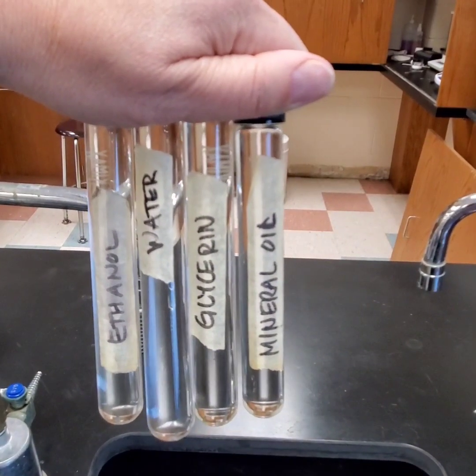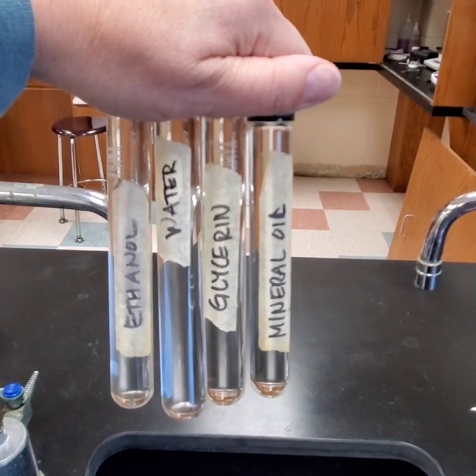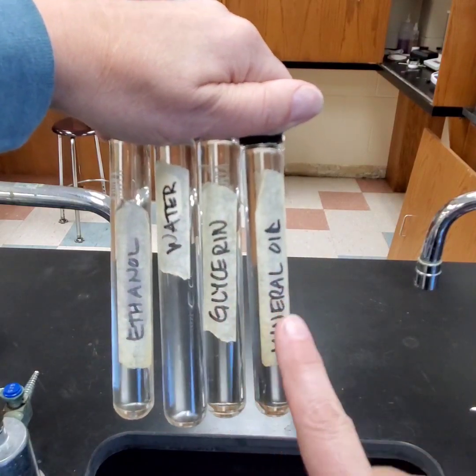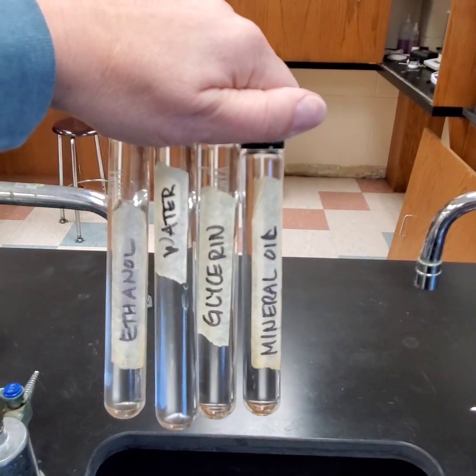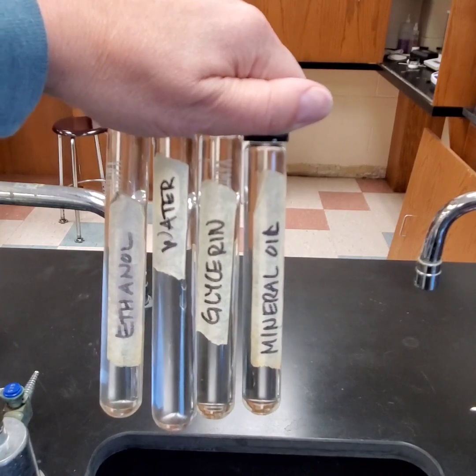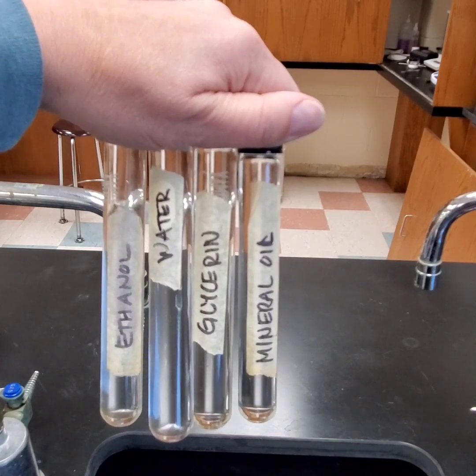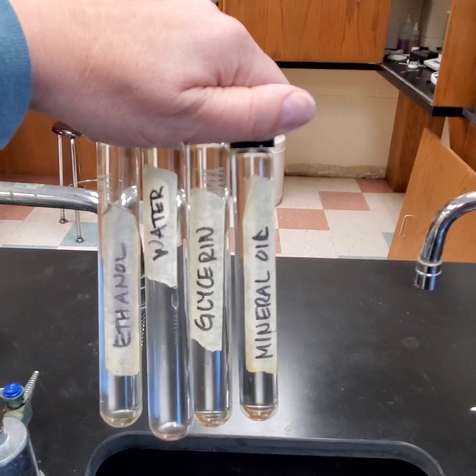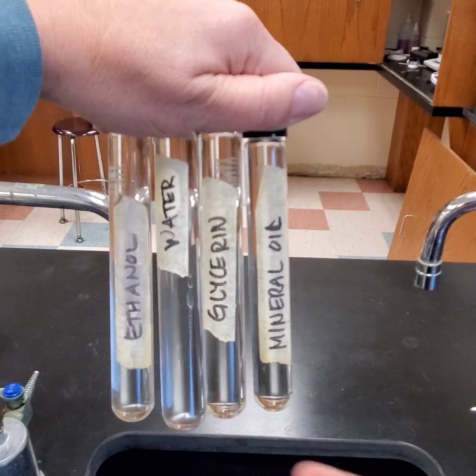Okay, for this part, we're looking at something called viscosity. Viscosity is a resistance to flow. What we have, and they're labeled, is ethanol, water, glycerin, and mineral oil. So we have 4 substances, and there's a little air bubble. I'm going to flip it, and you're going to rank which one the bubble moves the fastest in and which one the bubble moves the slowest in. If it moves the slowest, it's more viscous, and I will let you determine whether that means stronger or weaker intermolecular forces. If it moves quickly, it's not very viscous, not very resistant to flow.